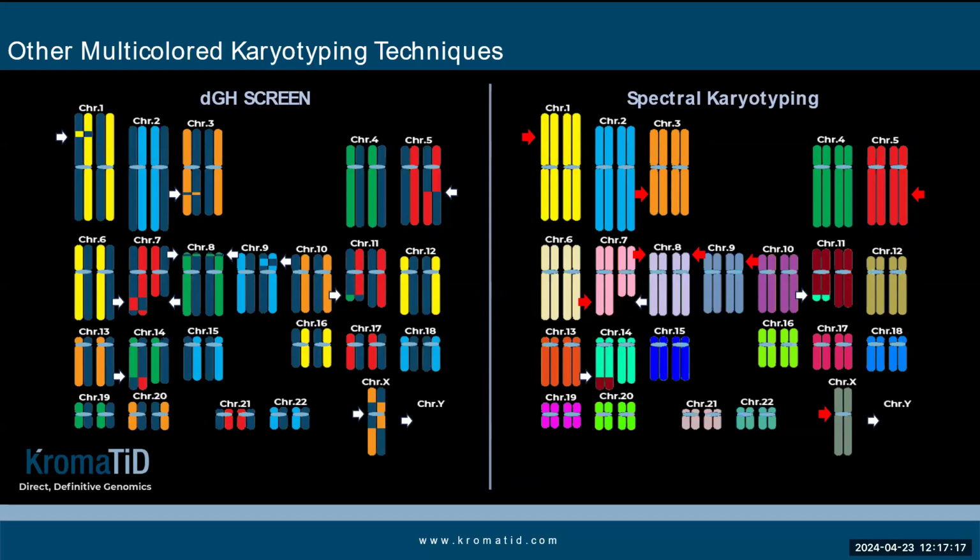In the SKY karyogram, 8 out of 12 of those arrows, 2/3, are red, because SKY detects nothing abnormal there. They indicate data which has been left on the table by not using DGH. Which genes have been affected by those rearrangements? How will they impact patient safety and regulatory approval?